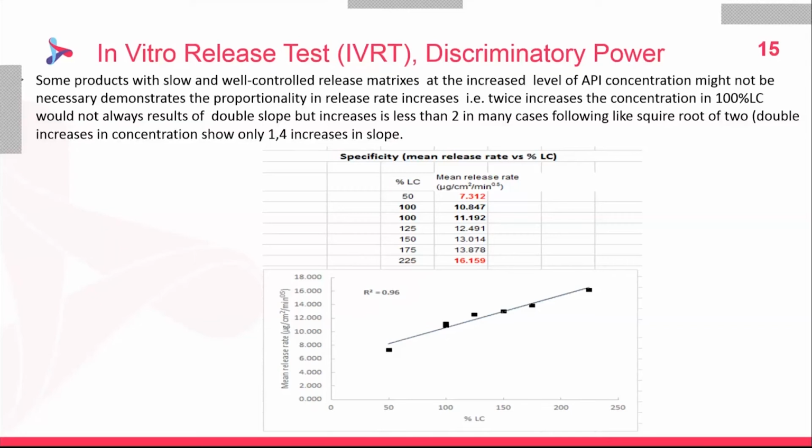Accordingly, with the Wilcoxon rank-sum Mann-Whitney rank test at 90% confidence interval, altered lots with 150% label claim could easily fall between 0.75 and 1.33, the wide range proposed by USP. Normally, in such formulations only the lots with 200% or more label claim fall outside the specified range, 75 to 133.